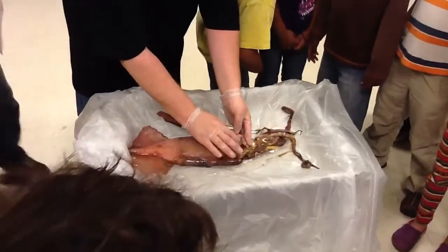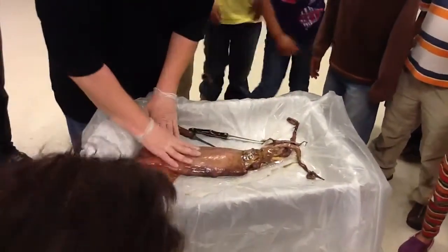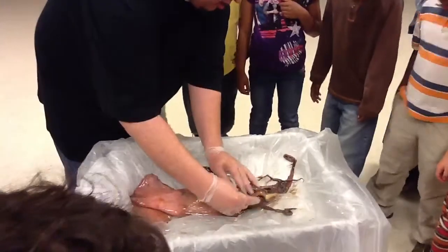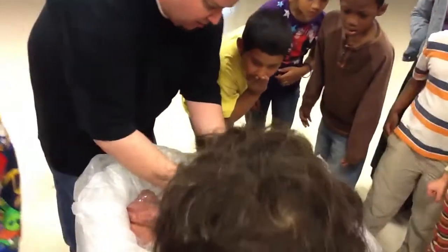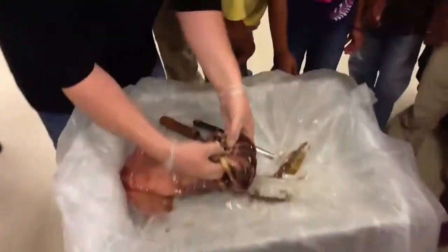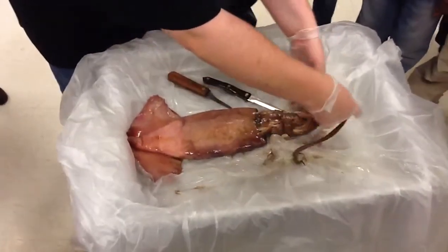It's got an opening — just a little opening right here — and that's where it would blow the water out. And then you can see the beak. Can we see it? It opened up. Beak! You can see it. Black beak, like a bird beak. You can see the side — it's pretty sharp. And it would pull in what it wants to eat and start munching away on it.